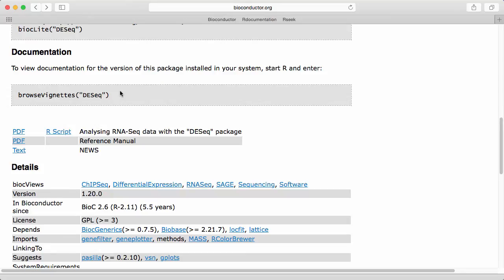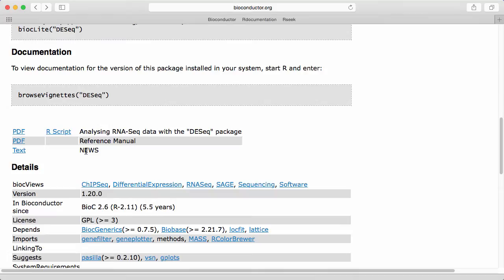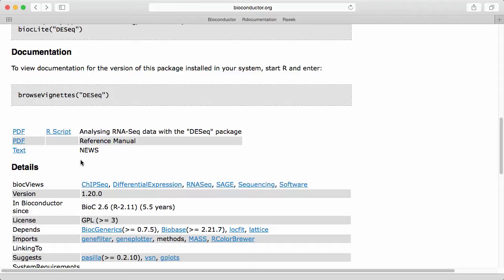Another thing that few packages utilize but which I sometimes find very useful is the package news file. So the idea is that the package author can put in information about what changes from version to version. This can sometimes be a lifesaver if there's a package you're using a lot and that's critical to your workflow. It's not a bad idea to look at the news file every time a new version is released or a new version of Bioconductor is released. So let's click on this.